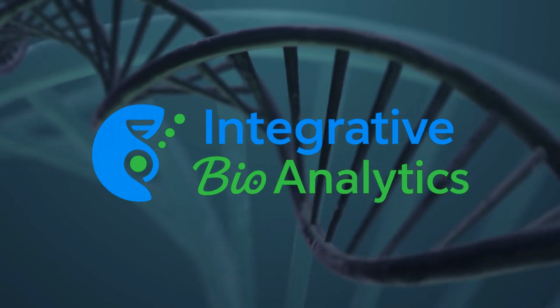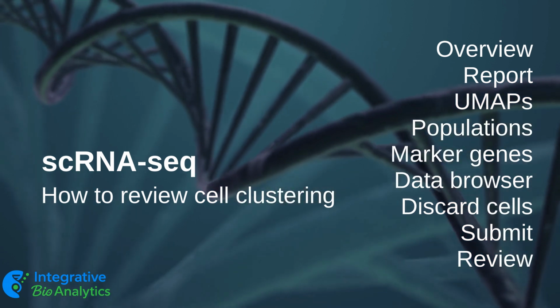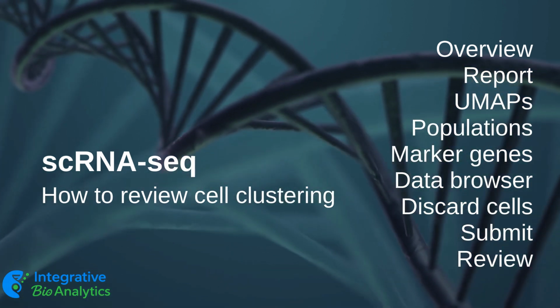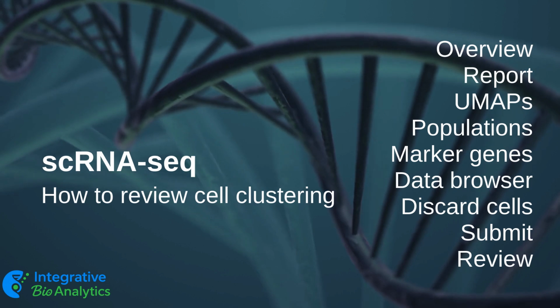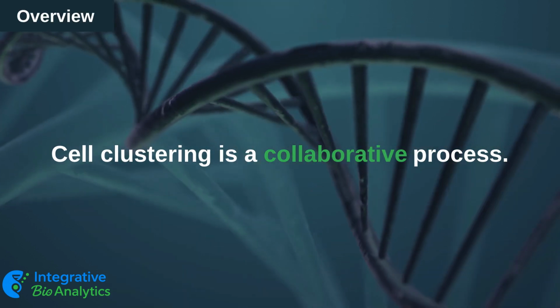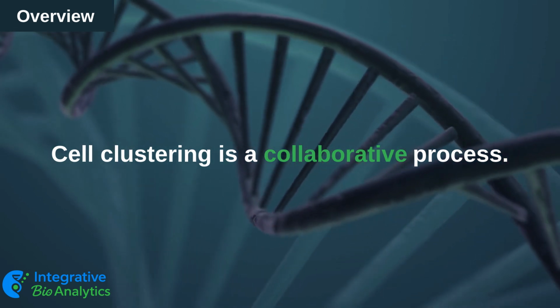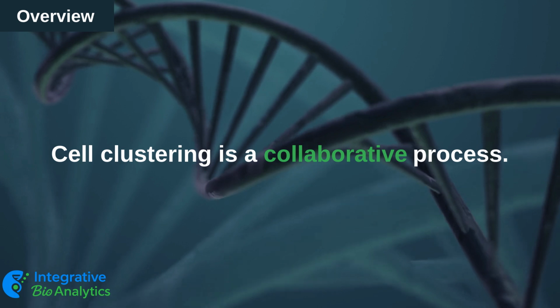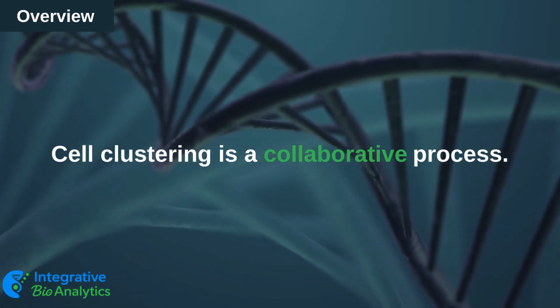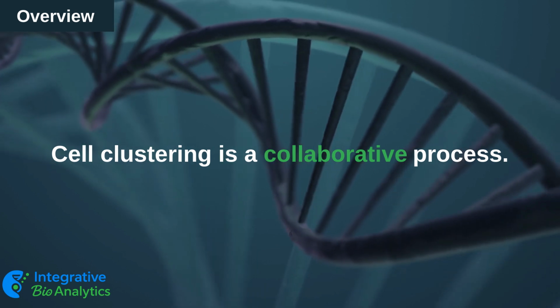Welcome to Integrative Bioanalytics. Today, we will go over how to define the final cell clusters for single-cell RNA-seq. Cell population identification is a collaborative process. We provide preliminary biological annotation, but the initial clusters and markers are strictly mathematical. Your insight is required to define the final populations based on your research goals and expertise.